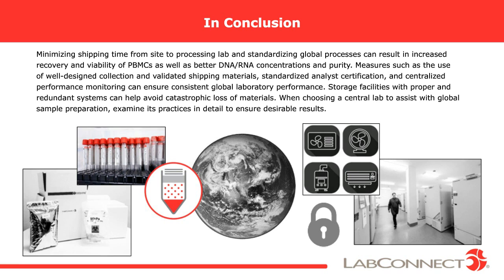In addition, well-designed collection kits, validated shipping materials, standardized analyst qualification, and centralized performance monitoring will all contribute to the success of sample processing and help to ensure consistent and quality performance across laboratories. In addition, proper storage is also essential to ensuring your samples are secure. Identifying redundancy in these systems will further ensure there is no loss or compromised samples. Overall, be thorough in choosing a central lab and your sample processing partners.